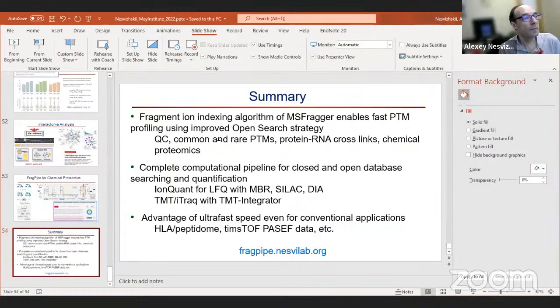Yeah, so we get a really good number of IDs. How reliable, if the question is about the accuracy of quantification, that's a really good question. I don't have a really good answer right now. I have not seen a lot of good benchmarking data sets to really look at the accuracy of quantification of, say, phospho data, DIA versus DDA. I've seen the number of IDs in DIA.